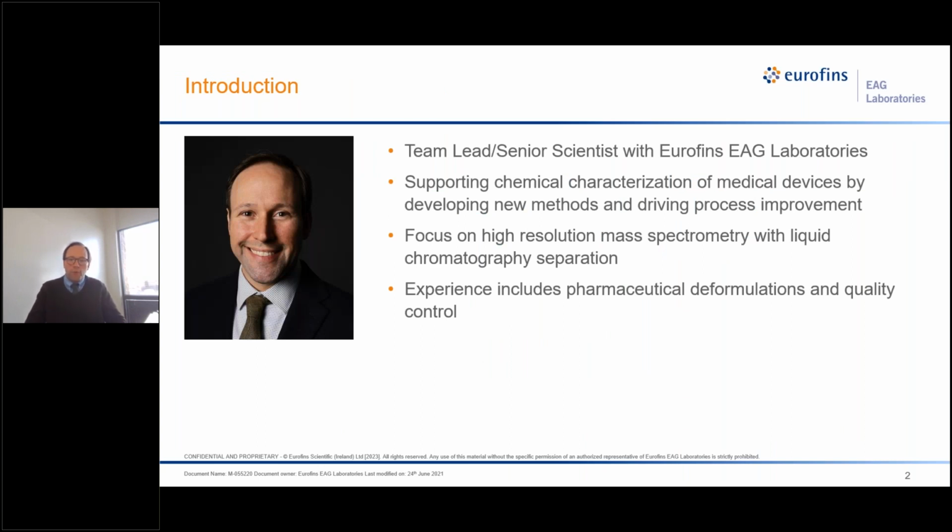So in my current role, I support chemical characterization of medical devices by developing new methods and driving process improvement. That's kind of the main thrust of my work, but I do also touch on other aspects of this. So some of it's development of methods in new directions for medical device testing, not just extractables and leachables, but also a lot of project support, especially for exceptional projects in terms of the setup or aims, and just kind of helping to navigate projects smoothly through scientific challenges.